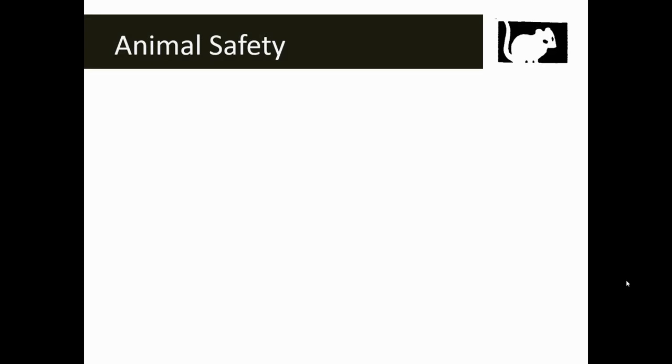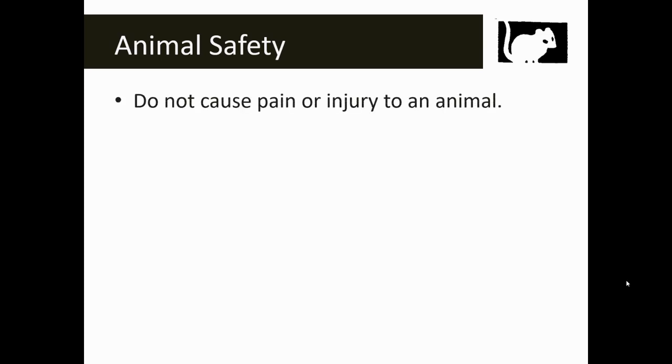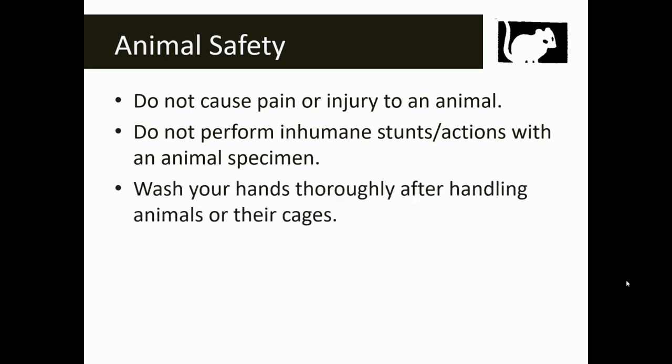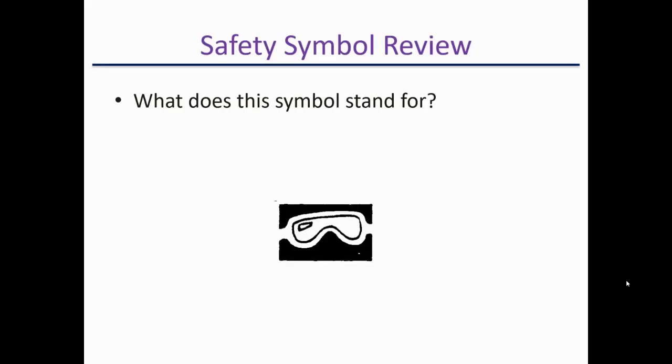Towards the end of the year, you're going to see the animal safety symbol anytime we have animals in the classroom that we might be touching — and for us, this includes specimens. Don't cause pain or injury to an animal, whether it's alive or dead. Do not perform inhumane actions with any animal specimen. Wash your hands thoroughly after handling animals or their cages — and again, this applies to specimens as well.